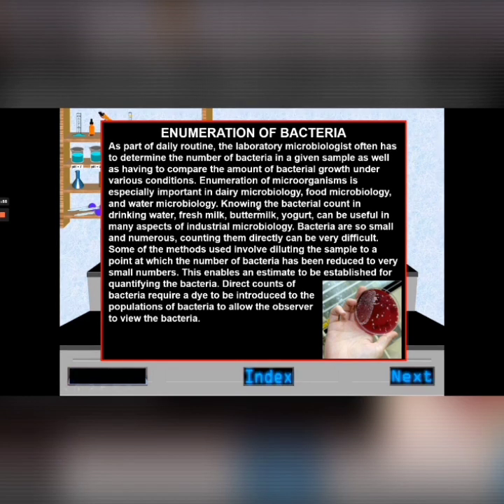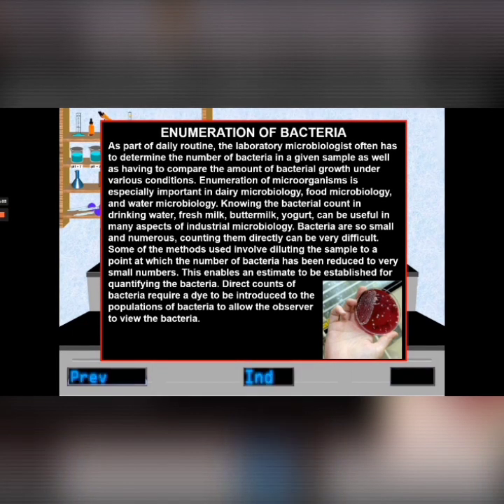Bacteria is so small and numerous, counting them directly can be very difficult. Some of the methods used involve diluting the sample to a point at which the number of bacteria has been reduced to a very small number.